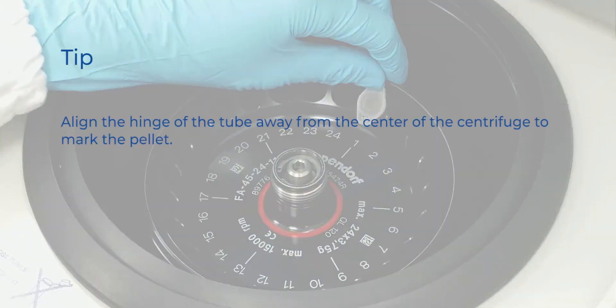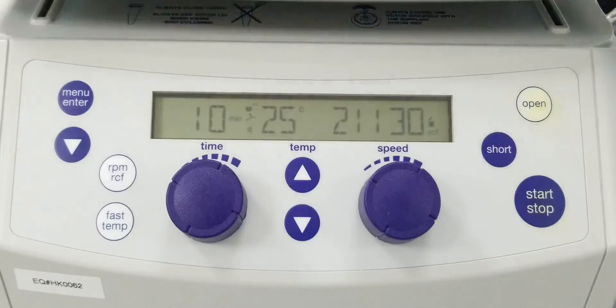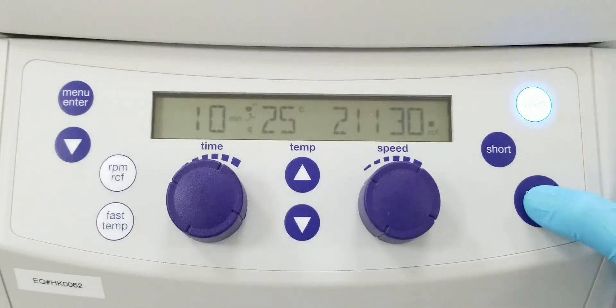Remember to align the hinge of the tube away from the center of the rotor to help locate the pellet after centrifugation. Max speed should be no lower than 4300 RCF.